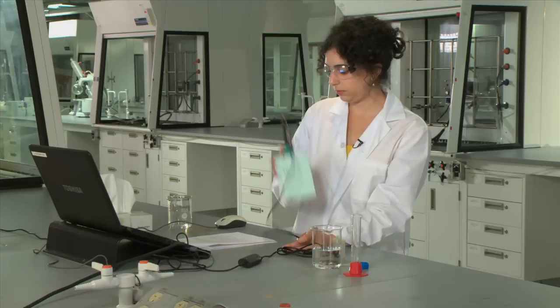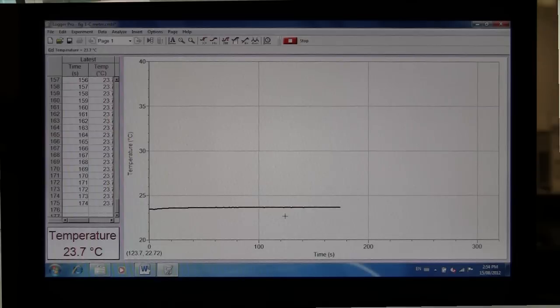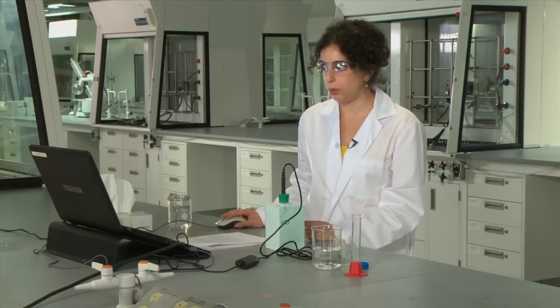So then you will do the same thing as before. Shake for about 60 seconds, let your calorimeter stand on the bench for about 100 seconds or until the temperature stabilizes on the program. When you have finished counting then record the temperature that comes out in your lab notebook and then stop the collection.